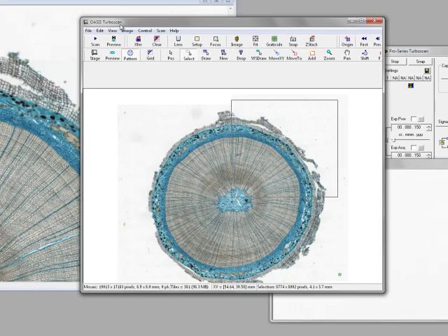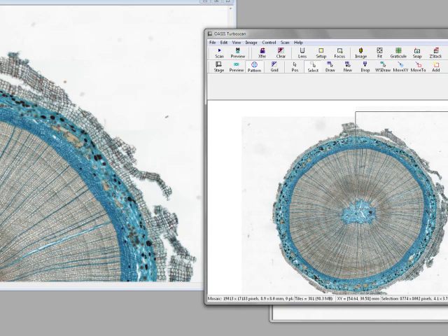Here we are. So now here is my image, which I can do some thresholding on or whatever I want to do with it. Again, as I say, we could take this image and chop it up maybe into 10 and put that into manageable analysis chunks for a regular Windows operating system to handle. So just to let you know, this is a 32-bit Windows 7 machine, and it works very simply and very easily. And the images that I've taken here are very large, but I'm having no problems in moving around with them.